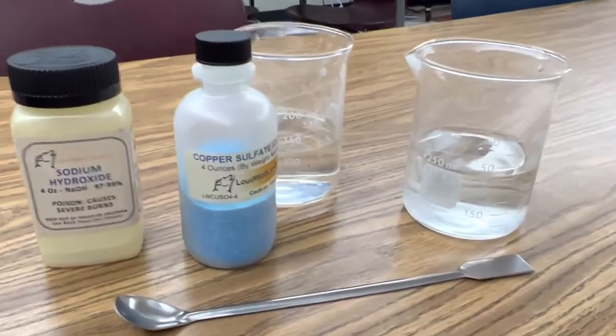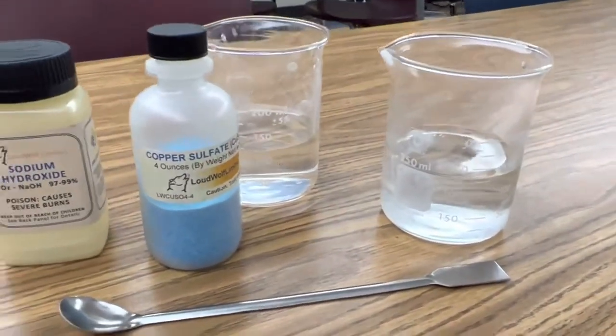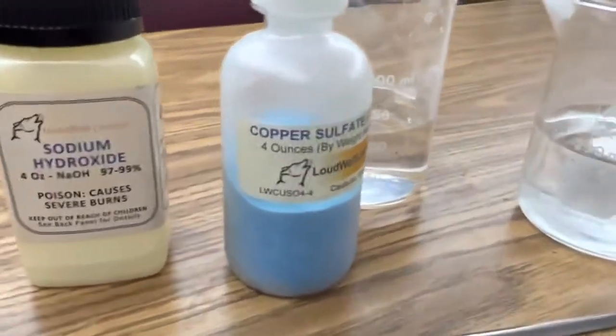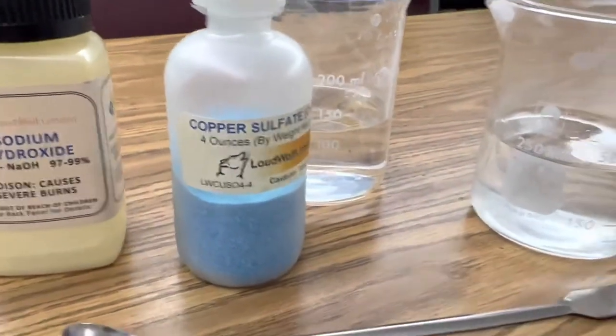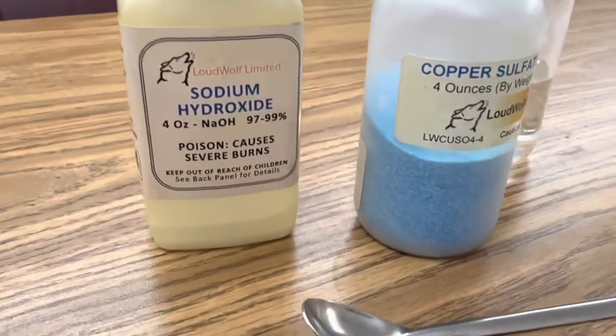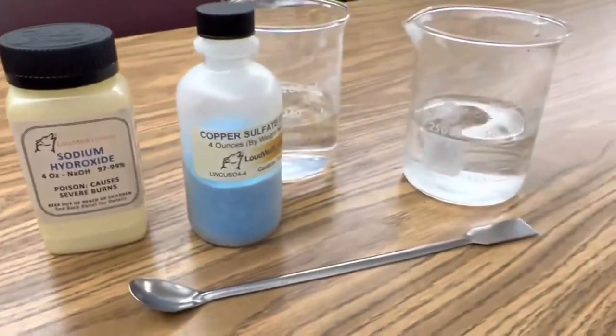So all you need for this reaction are a couple of beakers filled with 125 milliliters of distilled water, about five grams of copper sulfate in one solution, and about five grams of sodium hydroxide in the other solution.